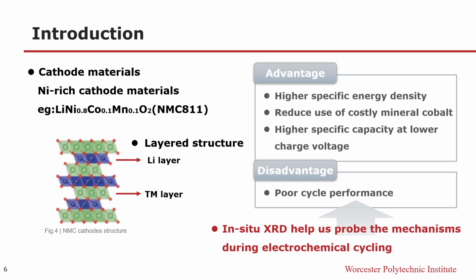Since batteries' material redox potential, capacity, and cycle life are strongly related to the evolution of their structural properties during the electrochemical reaction, the advanced in-situ XRD technology can provide us new insights into the structural changes and lithium dynamics of lithium nickel manganese cobalt oxide during the electrochemical charge and discharge, which are essential for a better understanding of its fast degradation.